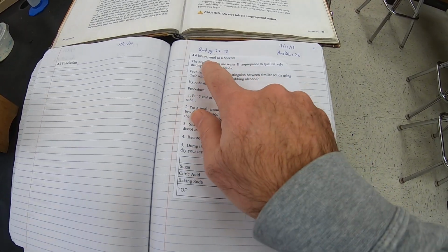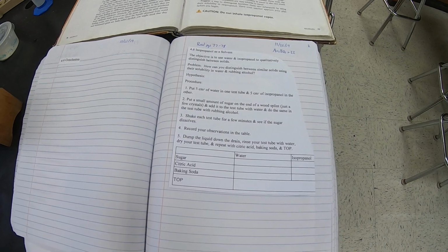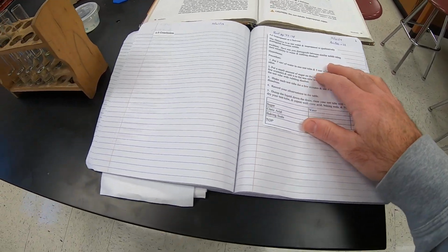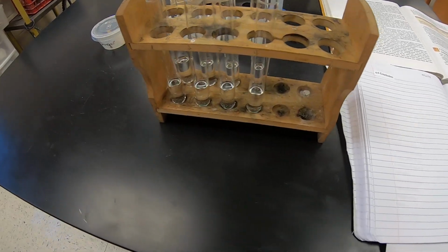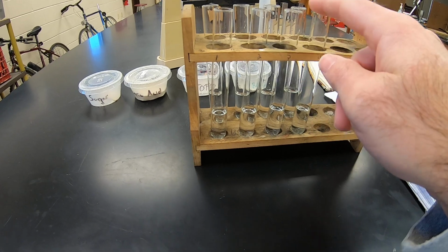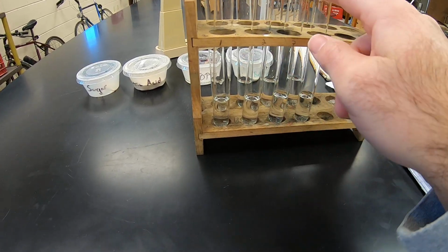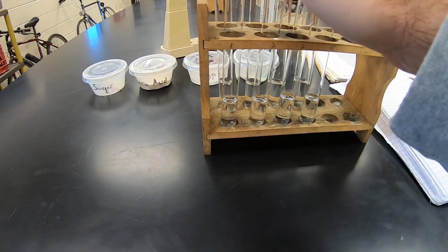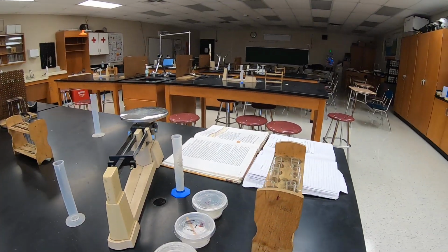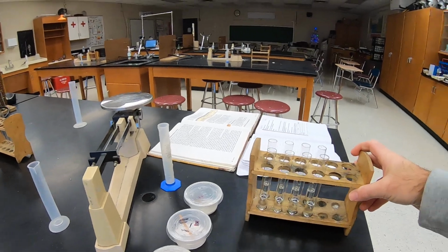So far, what we've used as a solvent is only water. So we're going to try a different solvent, isopropanol. It's just rubbing alcohol is all that it is. And so I'm going to do it a little bit differently than the directions say. What I've done here, these first 4 test tubes all have rubbing alcohol in them, 5 cubic centimeters, and the back 4 have water.